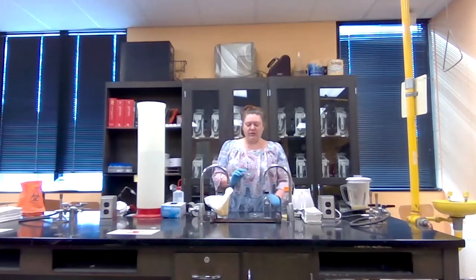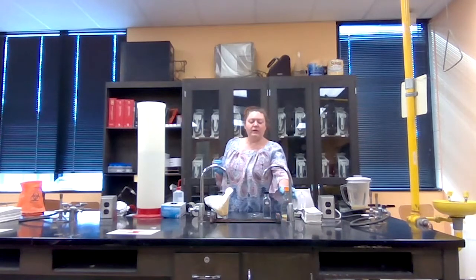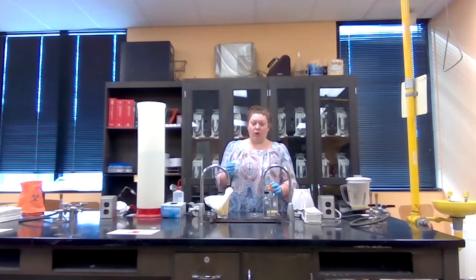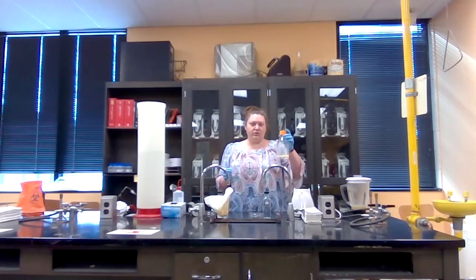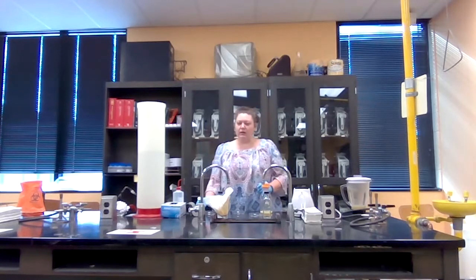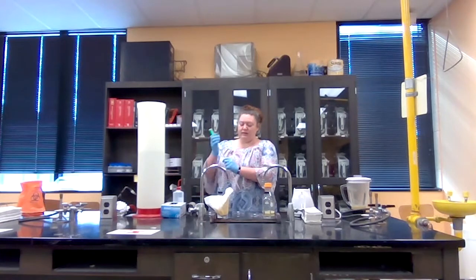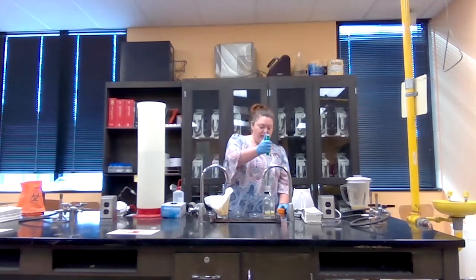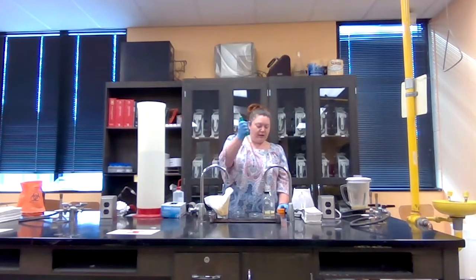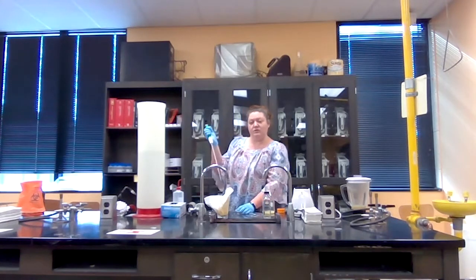And then I want a petri dish that's going to be a 1 to 100 dilution, or a 10 to the negative 2. And I can do that without actually diluting it in water, because I have a 10 to the negative 1 dilution in here. And if I take 1/10 out of here, meaning if I take 0.1 milliliter of my taco solution out of the container, then I will end up with a 10 to the negative 2 dilution.